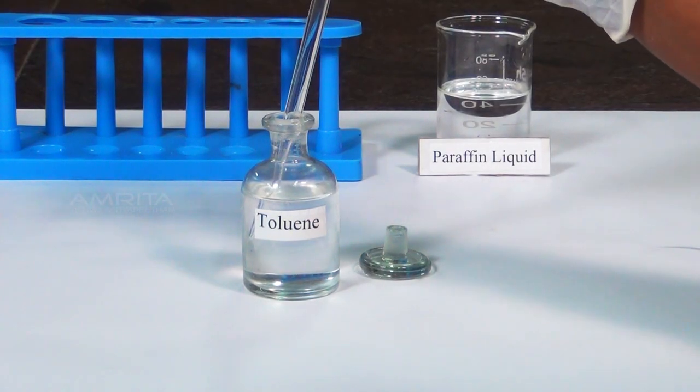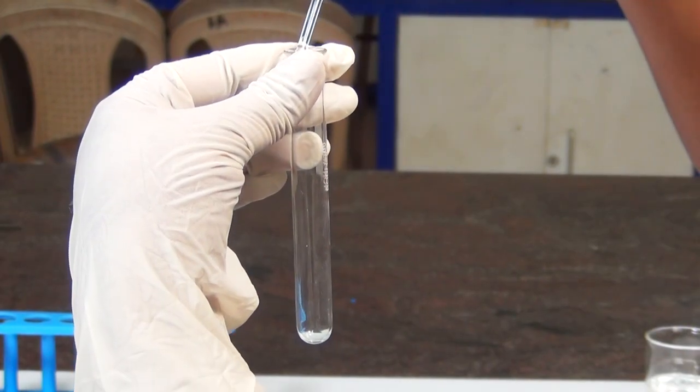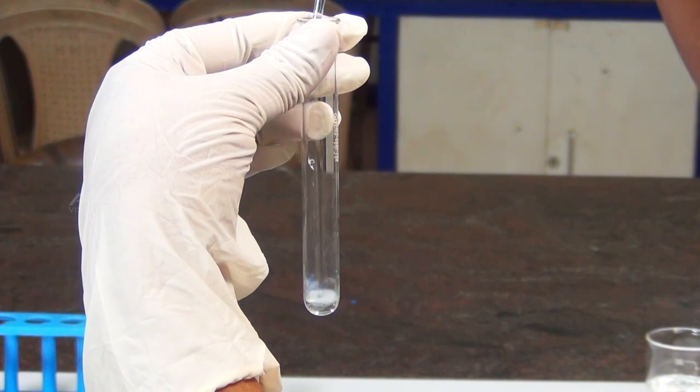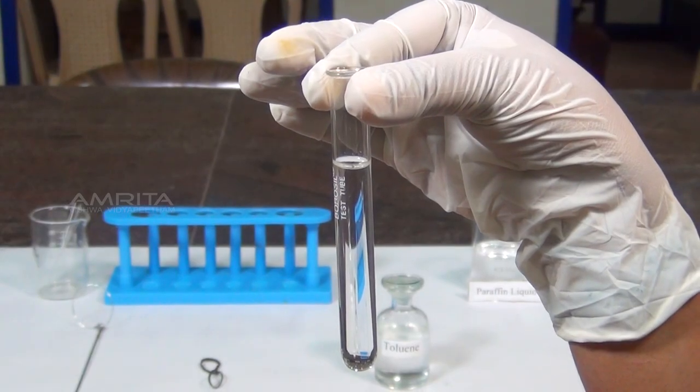Procedure. Take the small test tube and using a dropper, fill it two thirds full with the organic liquid toluene whose boiling point needs to be determined.